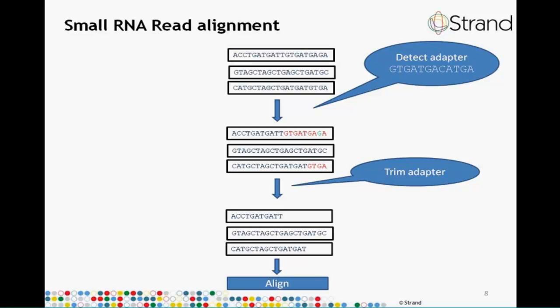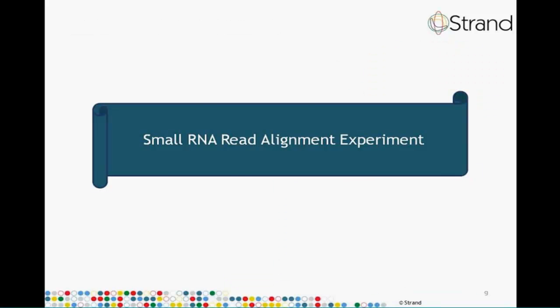So because of these multiple steps, in other words, finding the adapter, trimming the adapter, and being able to align variable length reads, we decided to include alignment as a new experiment type in Avadis NGS for the upcoming release. So let's take a look at what the alignment experiment looks like.